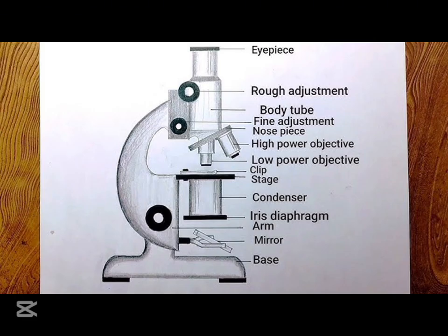All right, how about something beautiful, like a snowflake? Ooh, I love snowflakes, but I've never actually seen one up close. Under a microscope, a snowflake is just stunning. All these intricate patterns and delicate structures, each one is unique, like a tiny work of art. You can see the symmetry and all the little branches that make up its crystalline structure. It sounds magical. So microscopes can show us the hidden beauty in everyday things. But what about science?